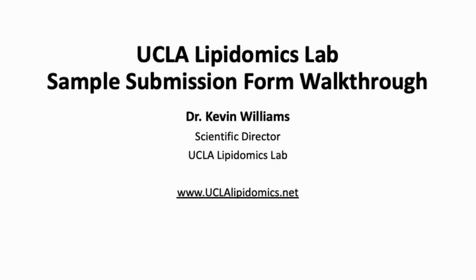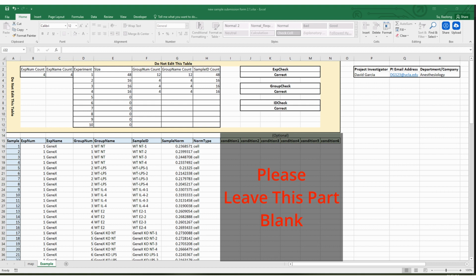Hello, this video is intended for clients of the UCLA Lipidomics lab. In this video, we will walk you through the sample submission form. This Excel workbook allows customers to provide detailed information necessary for the analysis of their lipidomics data. Filling out this form properly ensures that the final data you receive is accurate and easy to interpret.